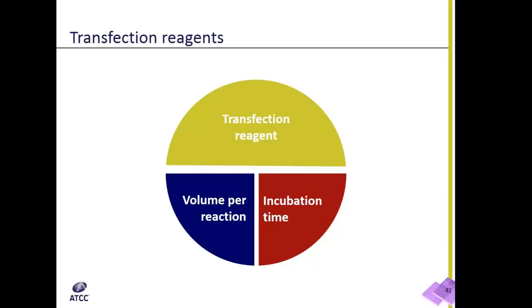Finally, some considerations regarding the choice of transfection reagent. Every transfection reagent will come with generally suggested volumes of reagent and nucleic acid and a recommended incubation time for complexing and to allow the complex to be in contact with the cells. However, different cell types may require different conditions, so you should always try a few different DNA-lipid ratios. We provide an optimization scheme on our website, and you should also make note that incubation time can also vary on reagent and cell type.